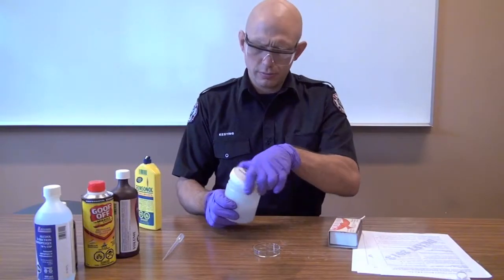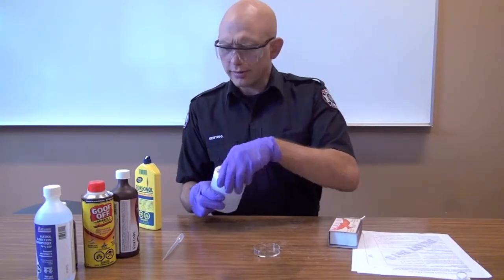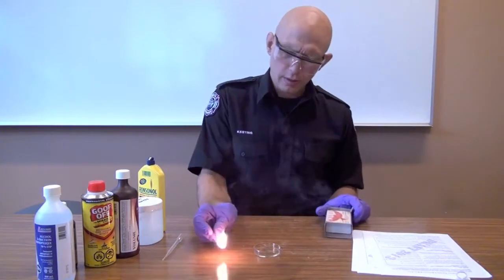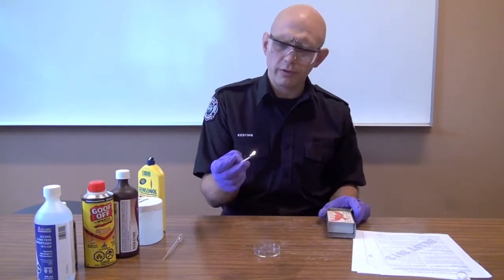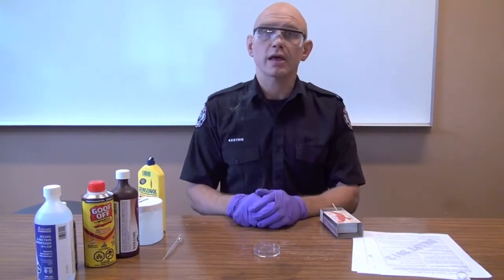This is methanol — it's an alcohol. Add a tiny bit to the petri dish and let's see if methanol is flammable. Bringing the match in from the side — it caught fire long before it touched. It's hard to see, but it's burning with a light blue flame with hardly any smoke.